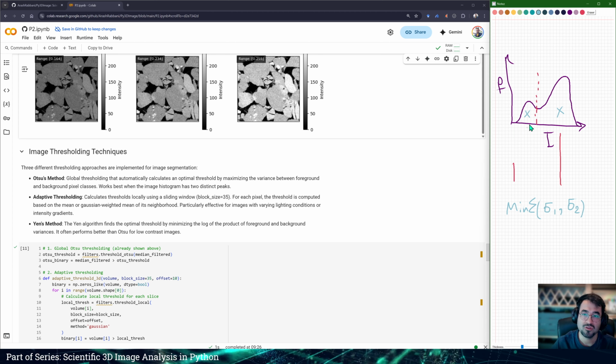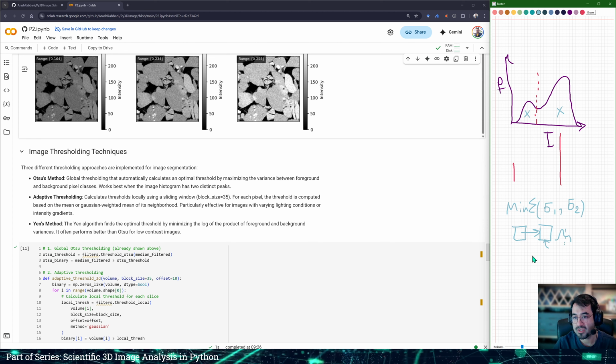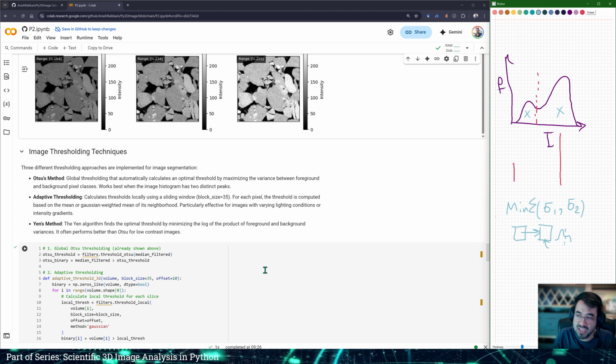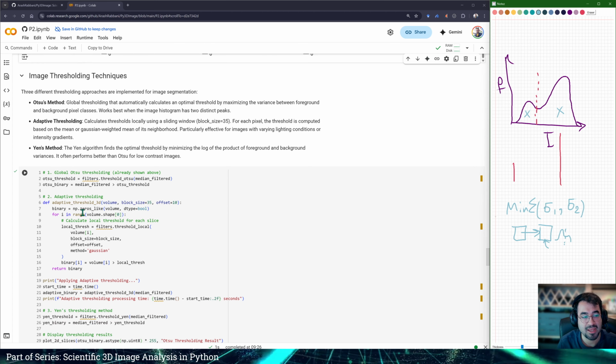So what we need to do is use a sliding window that goes location by location on the image space, and inside each of these windows has its own thresholding. So it's going to be a locally adaptive thresholding method. Inside each of those blocks, you could use Otsu or any other algorithm. That is the approach when the overall color intensity is changing and you don't want it to be affected by that. You need to go with an adaptive method.